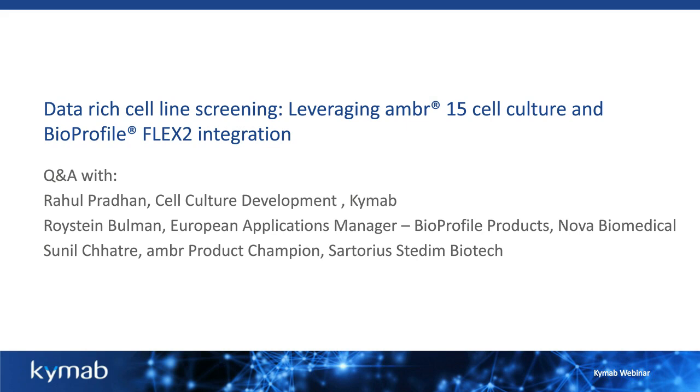I have a question on gassing. How often were you measuring offline samples using the FLEX2? If you're referring to the actual offline samples for the ambr vessels, we were taking a pH sample almost every day. There could be that when we missed a day or two, but mostly we had almost 15 pH samples in the course of the run.